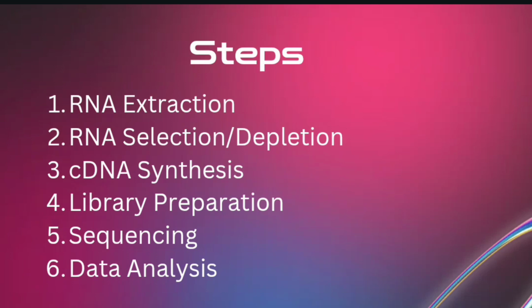Then we have to do the library preparation, adding adapters and preparing fragments for sequencing. In the sequencing step, we have to run the prepared library on a NGS platform. Then we have to do the data analysis by mapping reads, quantifying transcripts, and identifying differential expression.